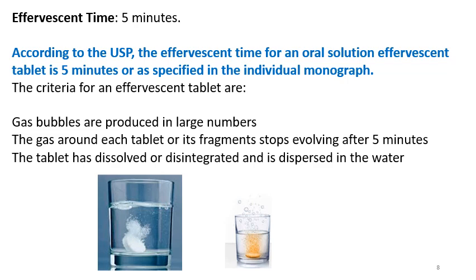The gas around each tablet or its fragment stops evolving after 5 minutes. The tablet has dissolved or disintegrated and is dispersed in the water. So these are the main points for testing the effervescent time.